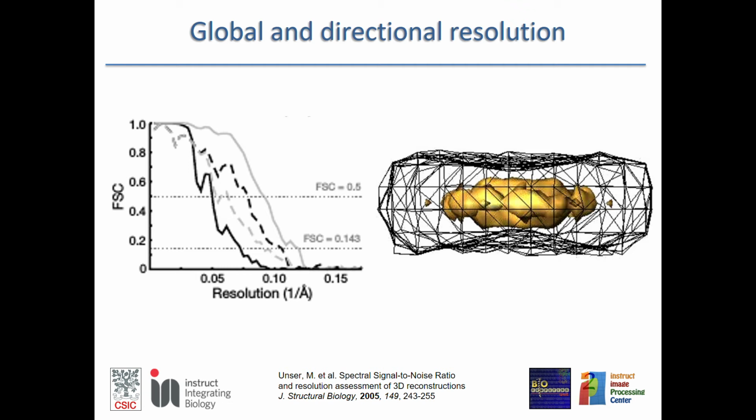So if there is no correlation, then you don't trust the structure. That is why we use the FSC, because if it is low, then we cannot trust it. But if it is high, there is still the possibility that you are committing systematic errors in both halves. And resolution is something that we measure with FSC in a global way, but it can also be measured locally.